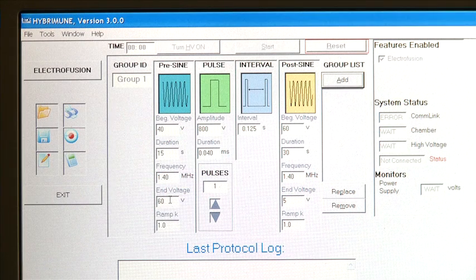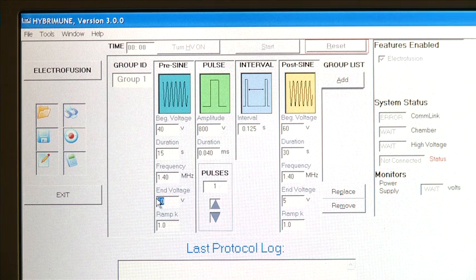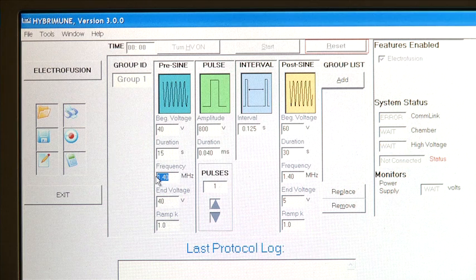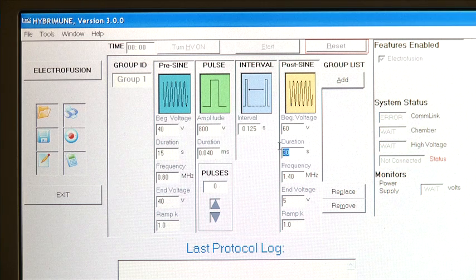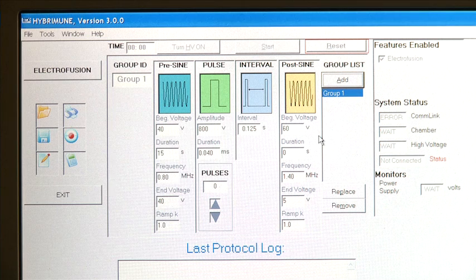To program a two-step electrofusion, set the beginning pre-sign voltage to 40 volts and the end voltage to 40 volts, with a pulse duration of 15 seconds and a frequency of 0.8 MHz. Set the high voltage pulse to zero and the post-sign to zero. Go to the group list and click Add. Group 1 is added.